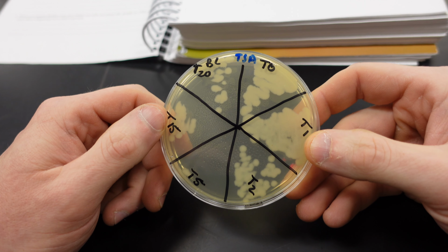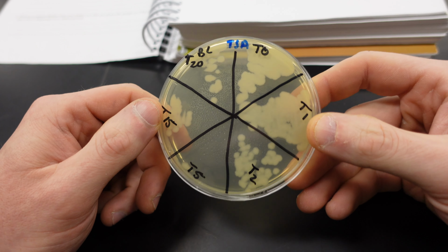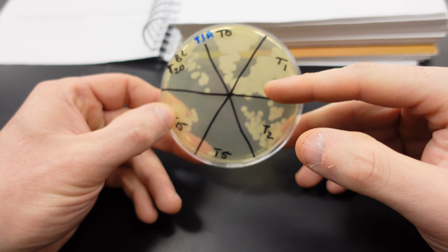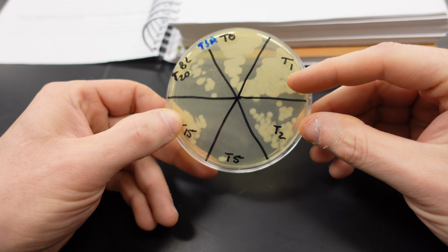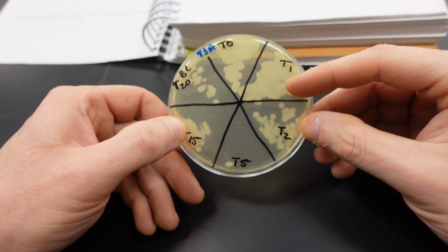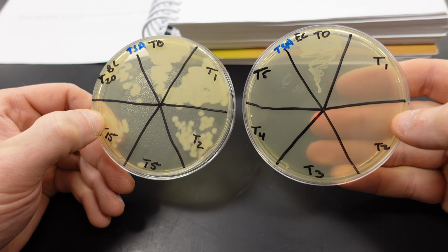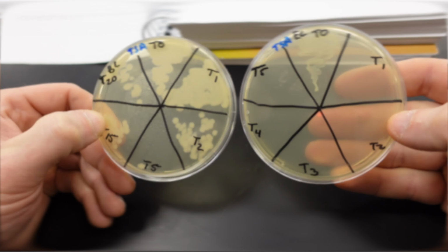Question number 9. When I sampled Bacillus from the test tube that was in the boiling water and plated the sample on this media, explain what is happening if you observe growth. Am I sampling vegetative cells? Or are the vegetative cells killed? Am I sampling the endospores? And did the endospores then germinate? So what is happening? Again, comparing to E. coli, E. coli does not form endospores, so those vegetative cells are quickly killed in the boiling water.